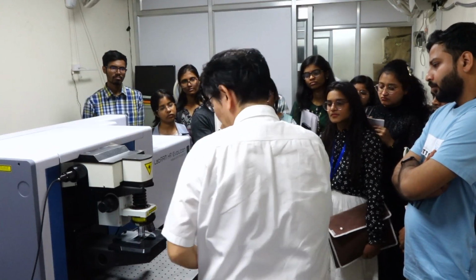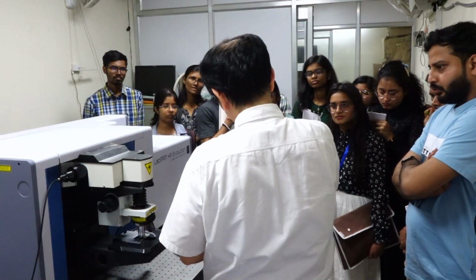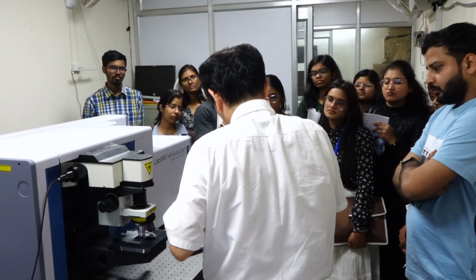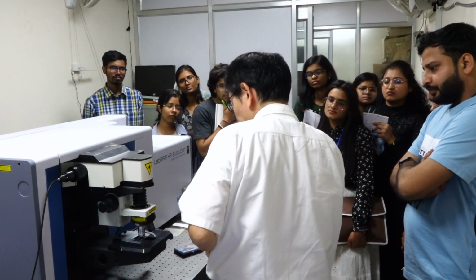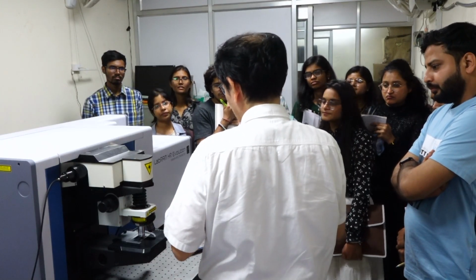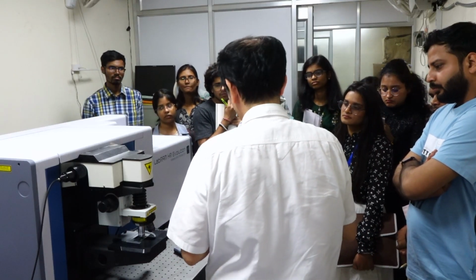How about this case? We illuminate the sample from the top by passing through the objective lens. Raman scattering occurs. Then, this objective lens serves as a signal collection lens at the same time.